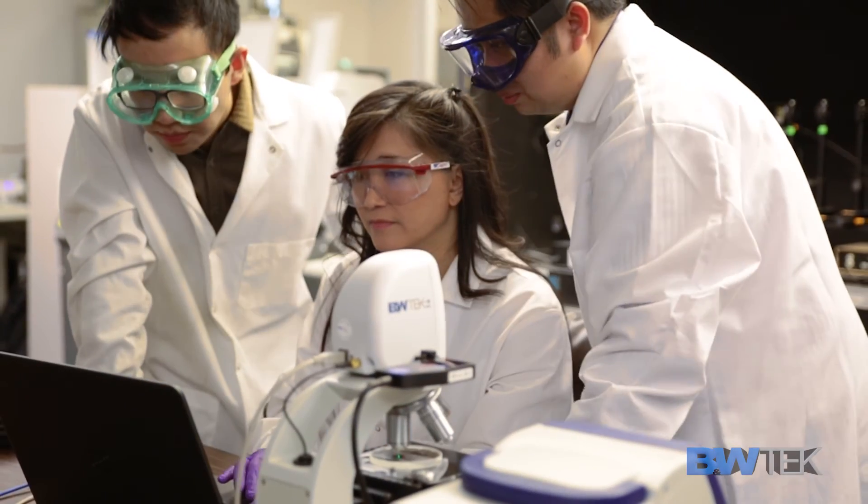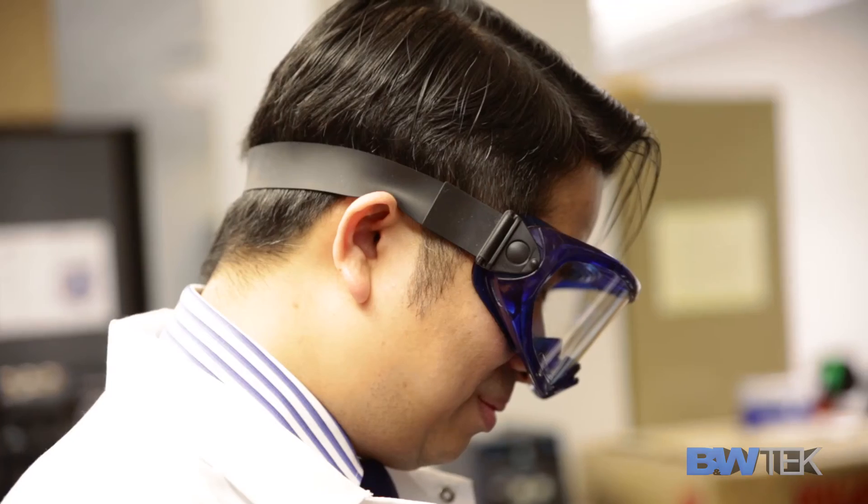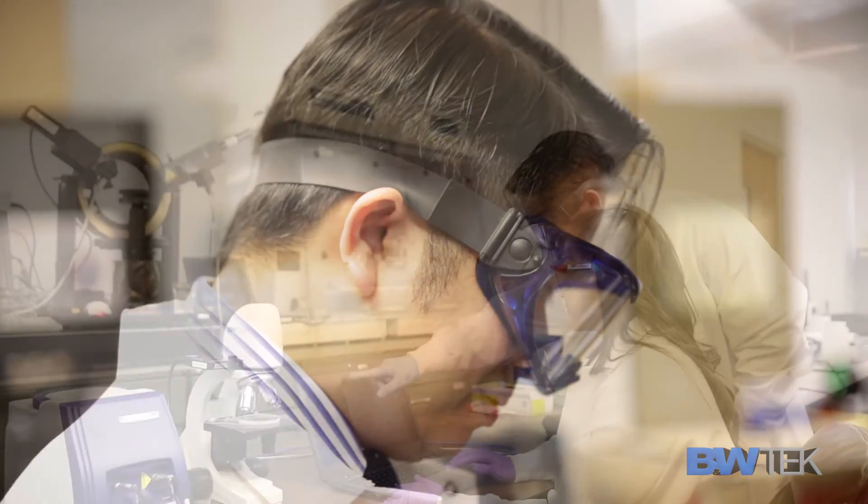We're able to harness our instrumentation background and our laboratory so that it brings the best out of students who are seeking a career in the sciences.